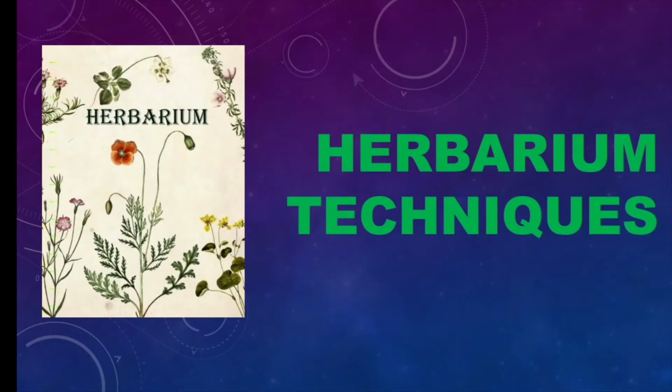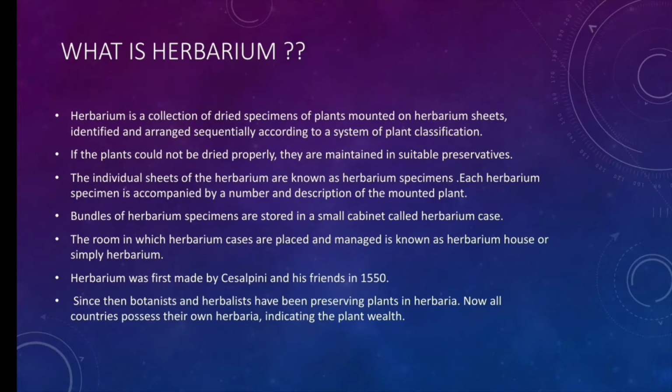Hello everyone. Here I am going to tell about the herbarium techniques in this video. You all have a doubt what is meant by herbarium. Herbarium is a collection of dried specimens of a plant mounted on herbarium sheets, identified and arranged sequentially according to the system of plant classification.